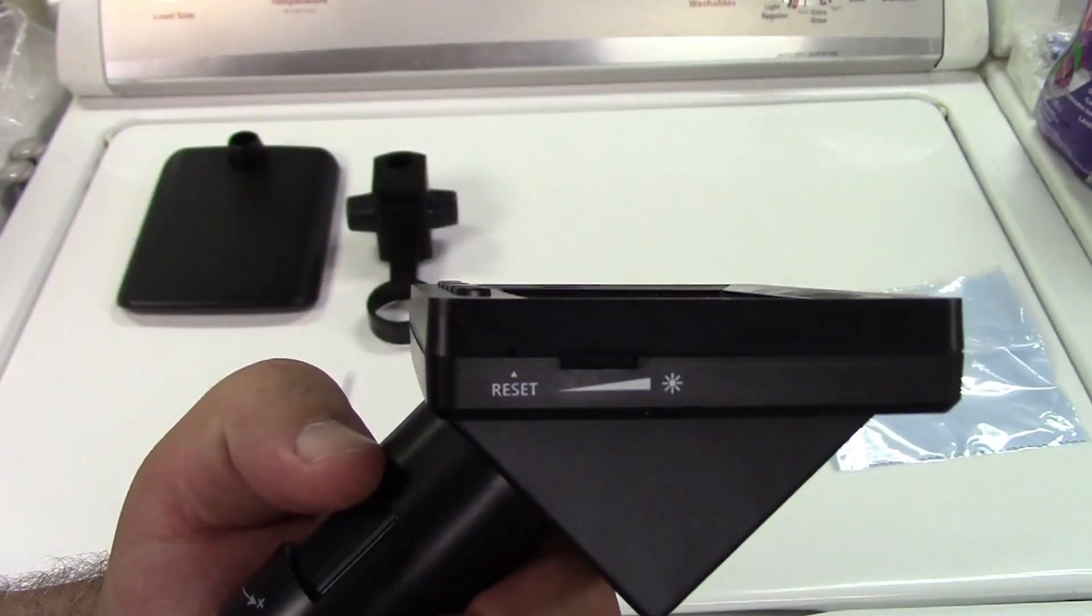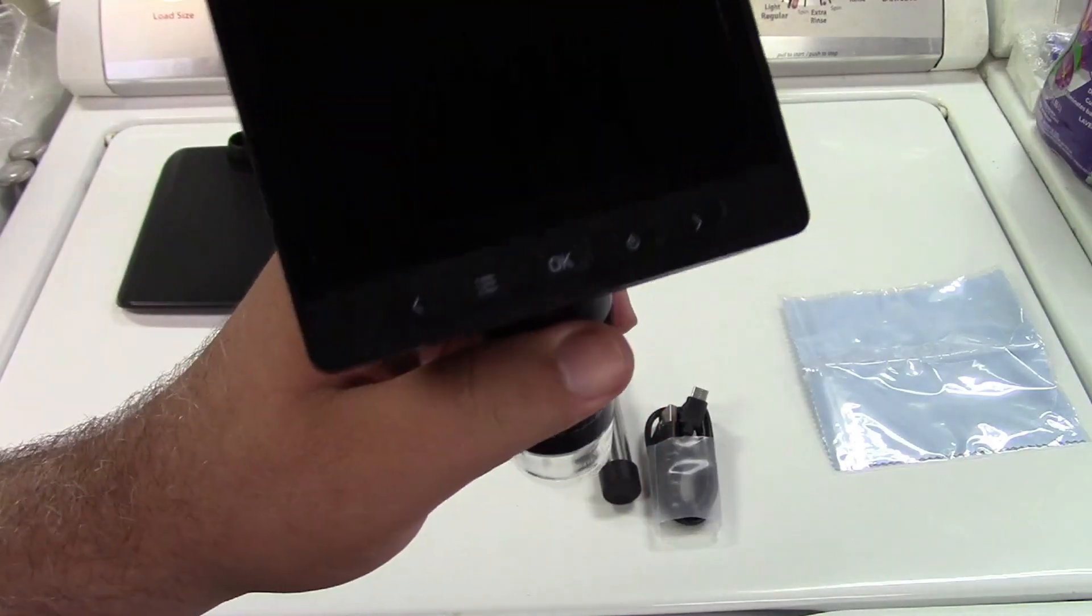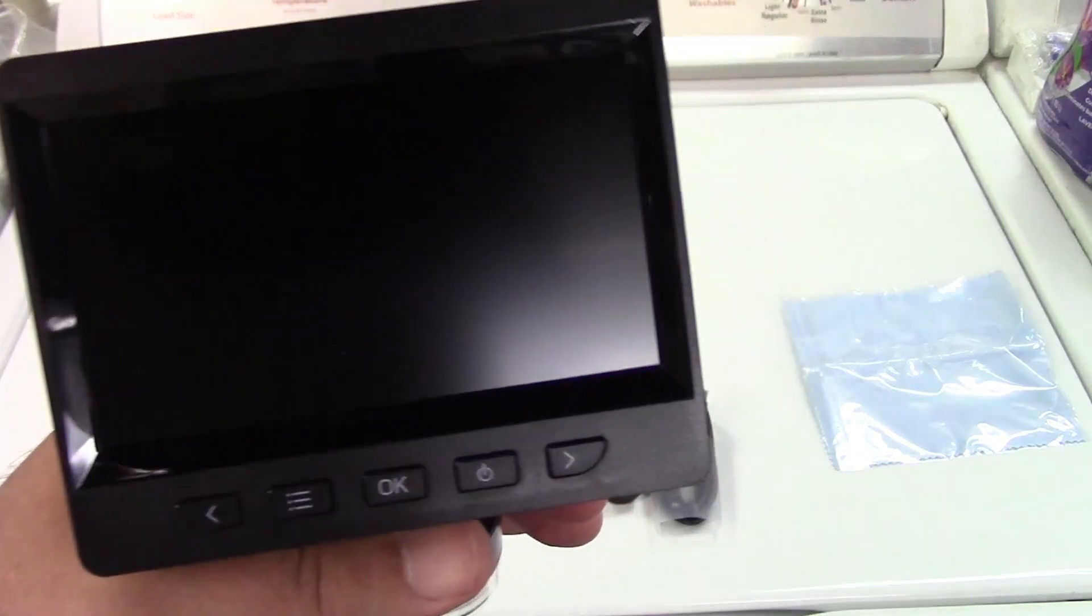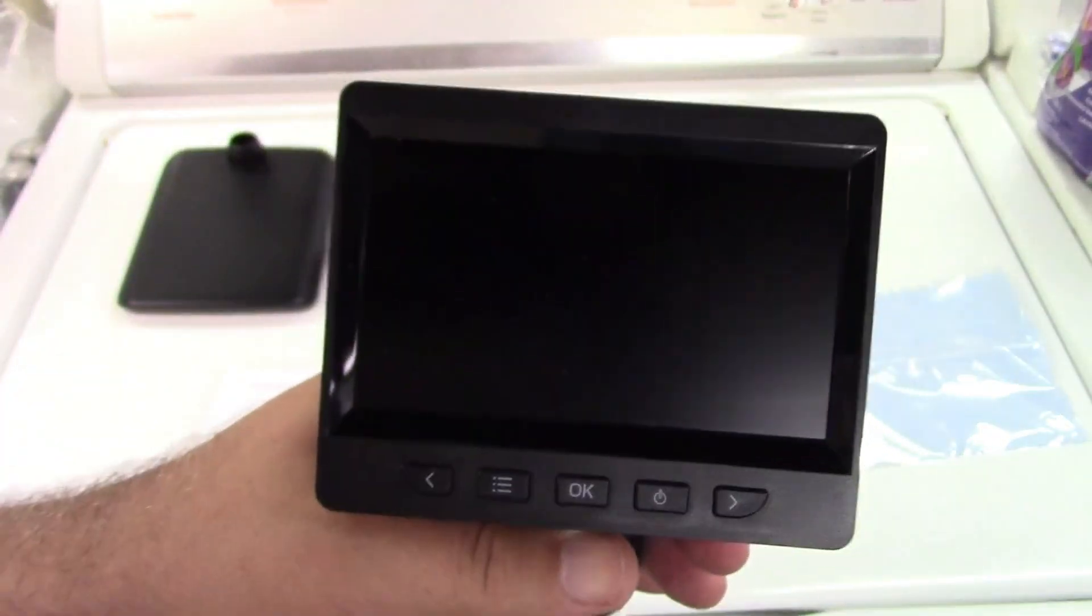And again, you can control the brightness right there with it. This also can connect to a computer, either PC or Mac.